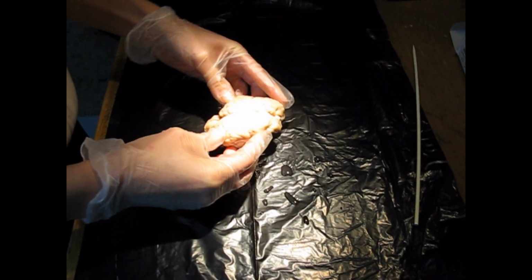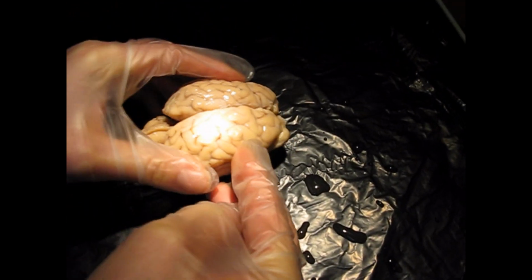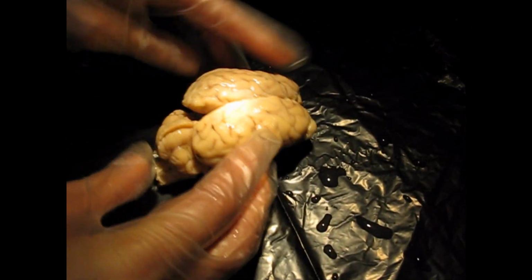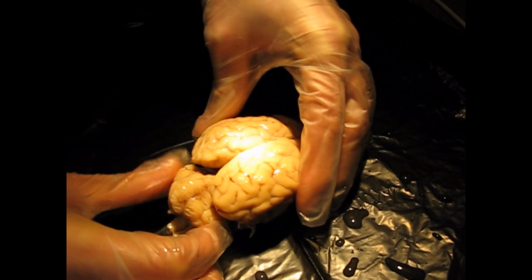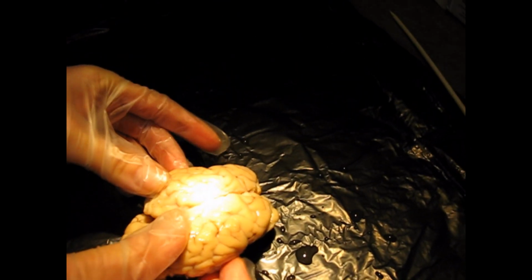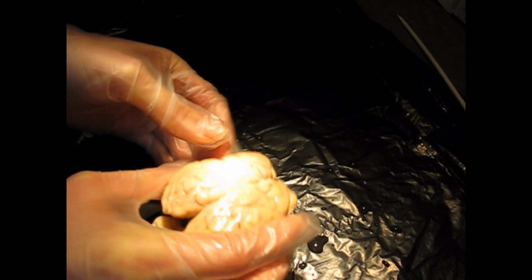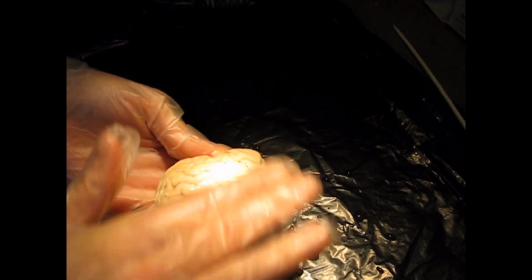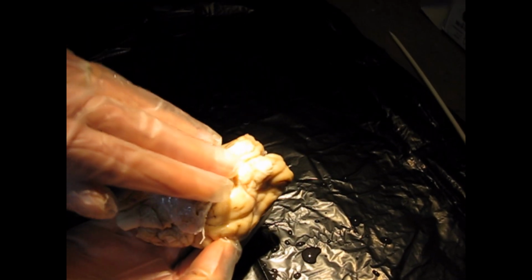Alright, well, we'll begin by getting oriented here with the brain. So if you look here, this is anterior, posterior, and I've already made one dissection, so imagine this together. Okay, so anterior, posterior, lateral, right, left. And if you remember, our orientations are a little bit different. This is dorsal, okay, that's very top, and ventral is the underneath.